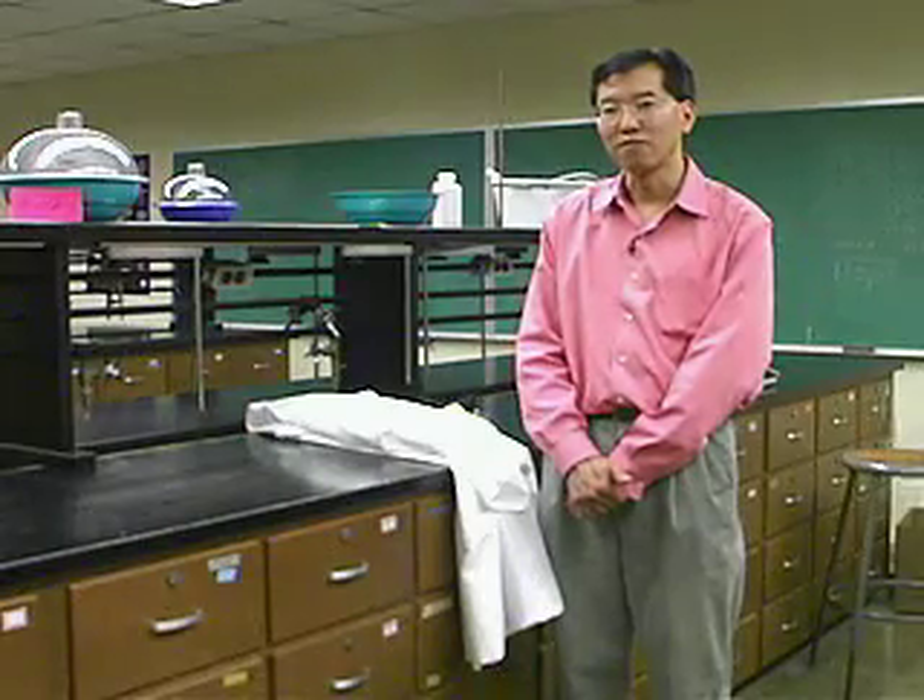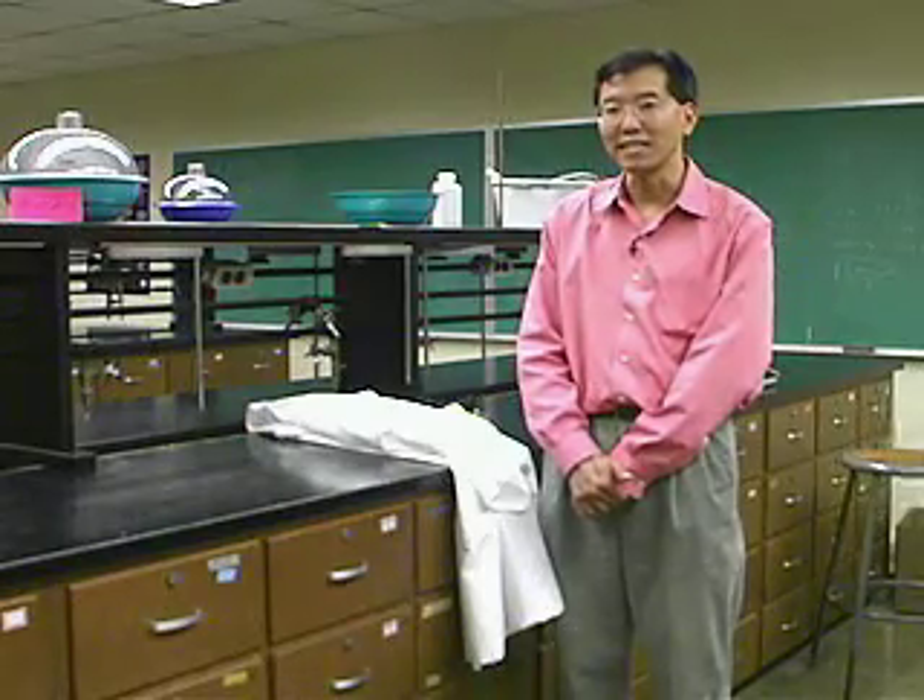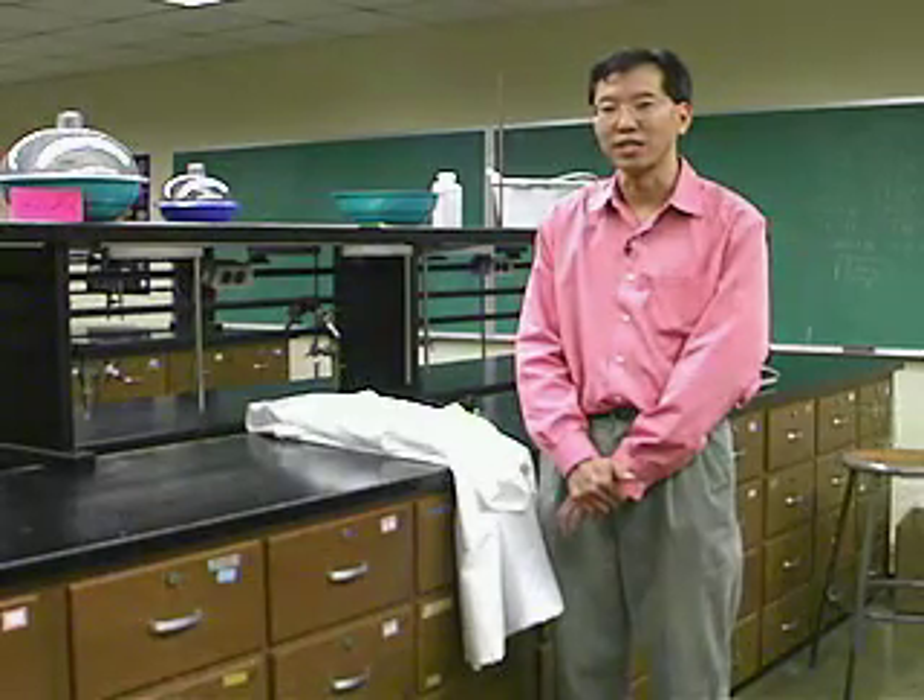We at ThinkWell thought it might be useful to you as a student if we made a series of demonstrations showing lab techniques. And the first lab technique always is safety — do things safely. In the videos that you're going to see, very often we haven't gone to the extreme of being absolutely safe, and mostly we've done that for the sake of clarity so that you could see what we were doing.